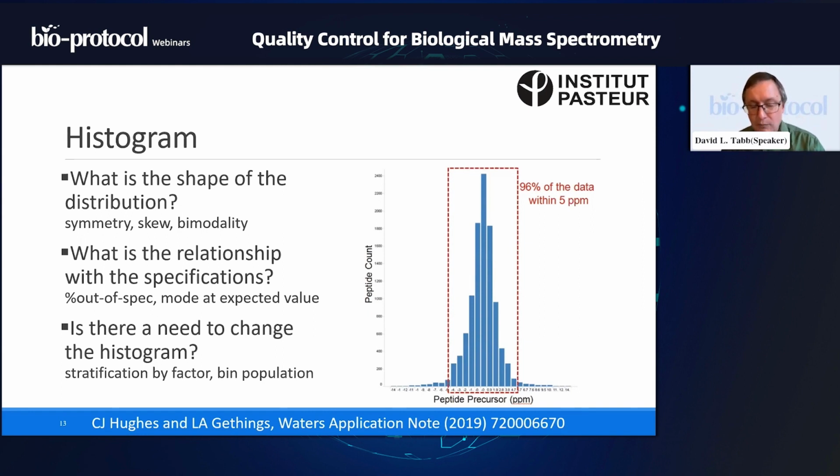So when we use histograms today, we're able to do so with quite a lot less labor than what was necessary in 1976. Just the same, Ishikawa had a lot of really good thoughts about how you should interpret whether a histogram is giving you good news or bad. So what is the shape of the distribution? I think a lot of people in science frequently make the mistake of believing that all distributions in their heart of hearts are normal distributions. And this is not the case.